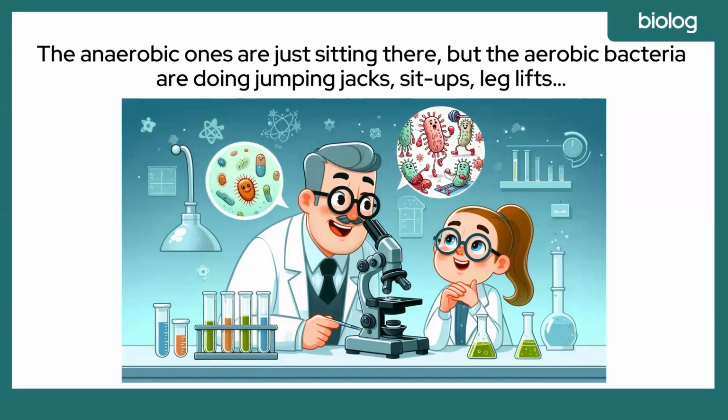Well, it seems the obligate anaerobes are just sort of inert, but I can assure you, anaerobic bacteria which thrive in oxygen-free environments also exhibit important behaviors, metabolizing a broad range of substrates and making contributions to the gut microbiome. These contributions are just harder to observe due to the challenging conditions under which obligate anaerobes grow, which encompass not only low oxygen, but also highly specialized media formulations which are needed to support them. So this misconception stems from the difficulty in studying them in a standard lab setting, which we will try to solve in today's webinar.